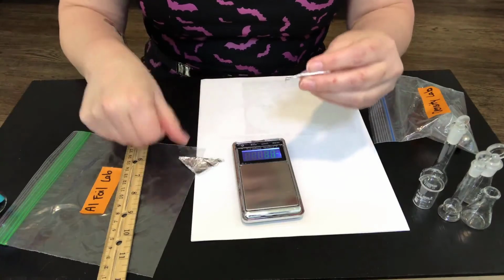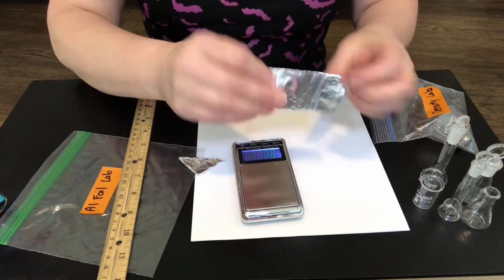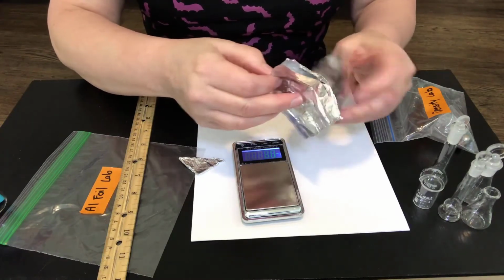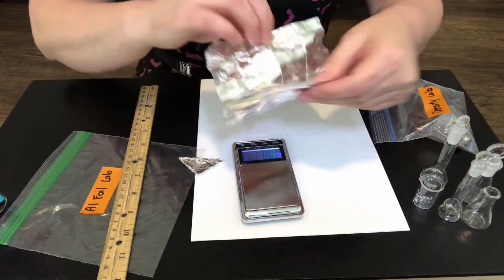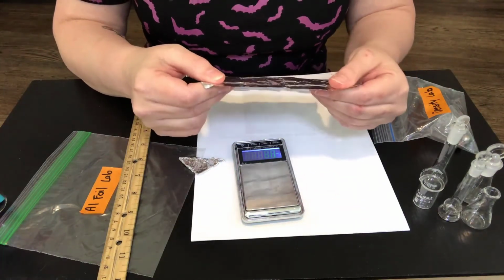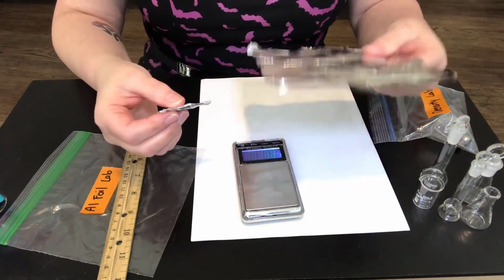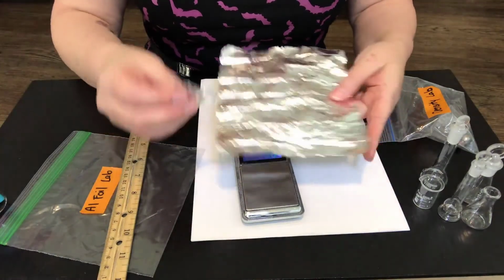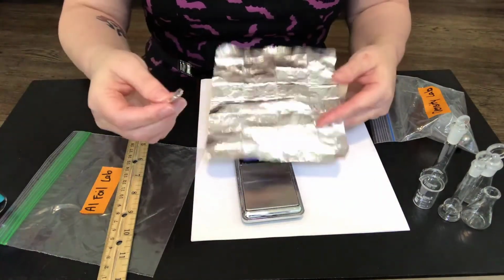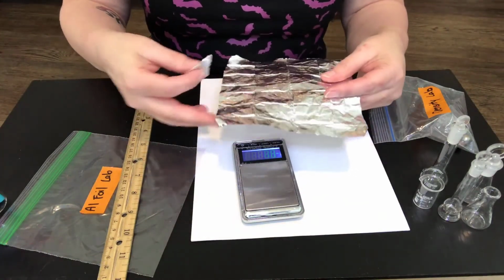And it may seem like these pieces of aluminum foil are two-dimensional. We know they're three-dimensional, but it may be odd to think of the width of a piece of aluminum foil. One of these pieces of aluminum foil, either the one you folded up like a rectangle or the one that you folded up like a triangle, is heavy duty aluminum foil, and the other is just regular aluminum foil.